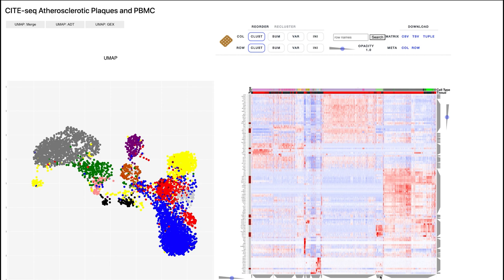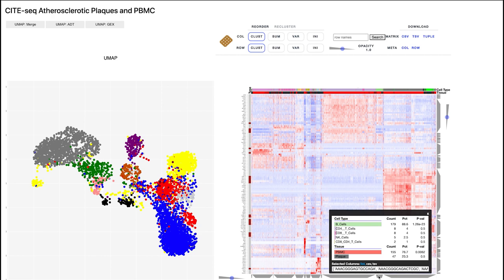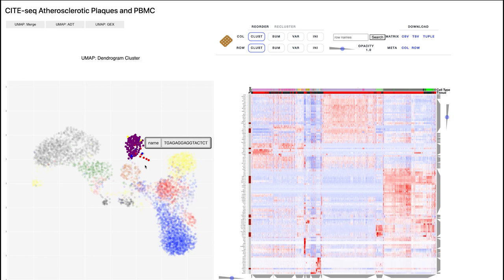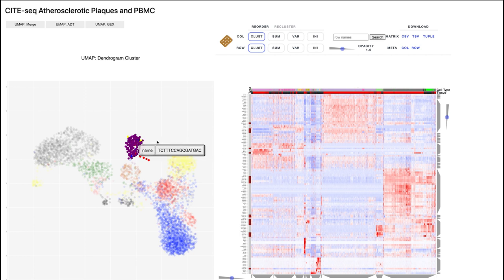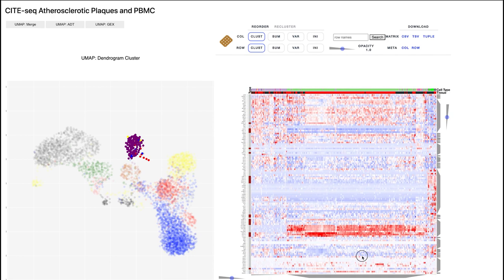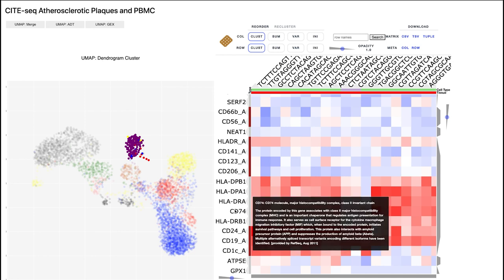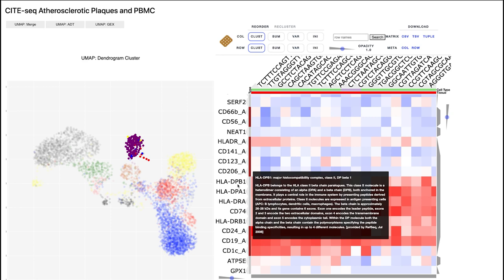Based on the expression of a particular protein or gene, you can start to understand what cell type you're working with. For instance, if you click the dendrogram here, you can see that this set of cells are predicted to be B cells. If you click here, you can see this is where these B cells show up on the UMAP. Zooming in on the UMAP, you can see all these are meant to be a similar cell type, but using the heatmap, you can zoom in and see that the main thing characterizing these cells is the high expression of proteins like CD19, CD24, and genes like HLA-DRA, CD74. We also have a component where you can hover over a gene name, and it will talk to an API called the Harmonizome from the Avi Ma'ayan group, and it will grab the full name of that gene and a reference description to help you understand the biology better.